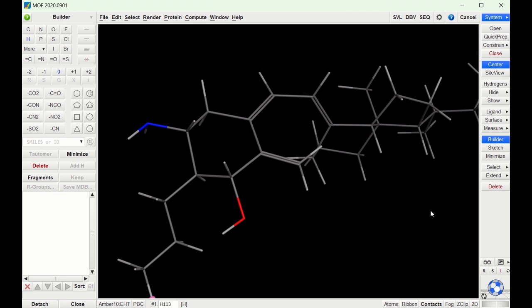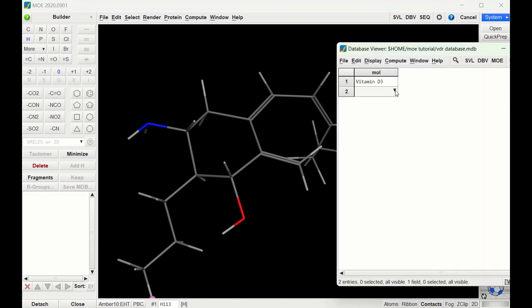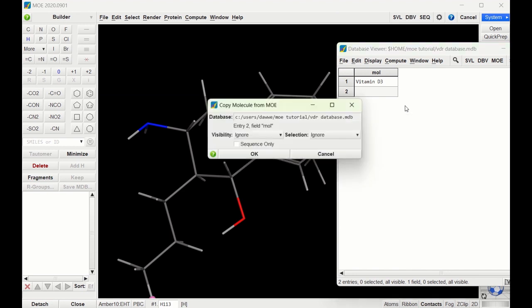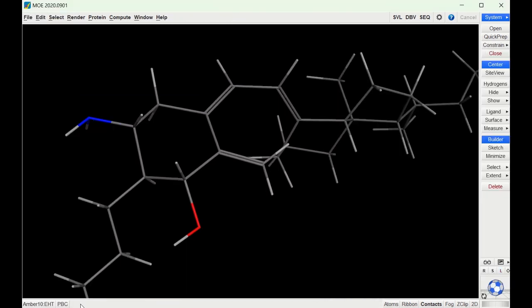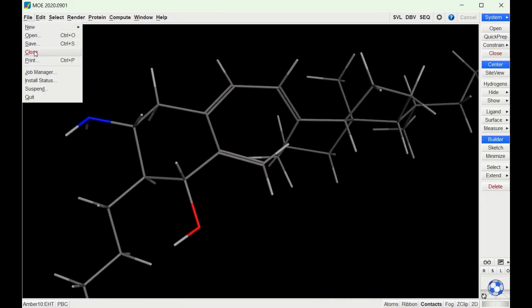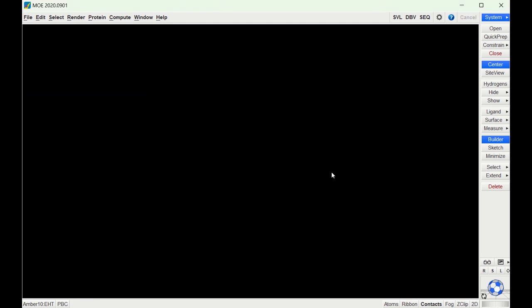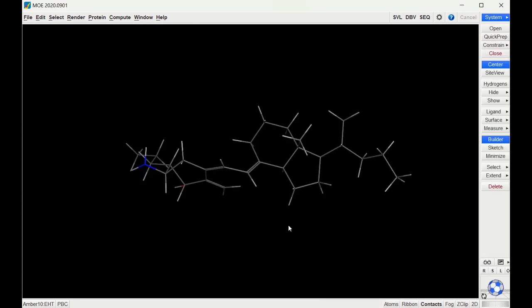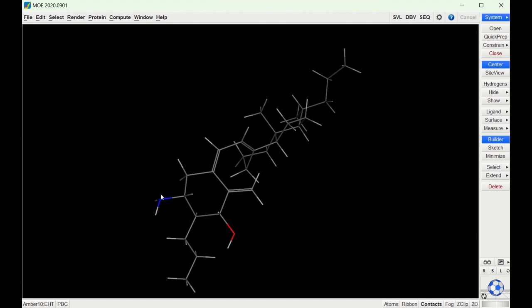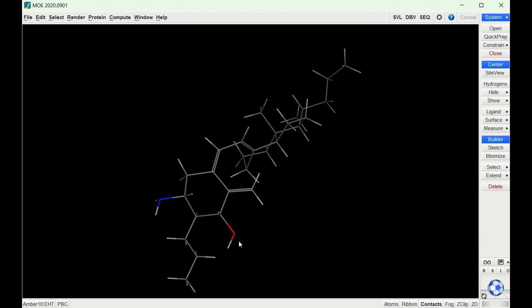So now let's say this is the structure that I want to add to the database. I can go back to the database, click the dropdown on the blank entry, and press Get from MOE and press OK, and then it will put in the structure that we just drew. Let's close out this structure, go back to our database, and if I click the dropdown and click Send to MOE you can see we have the structure we just edited — the amine we put in there, the oxygen, and that carbon chain.